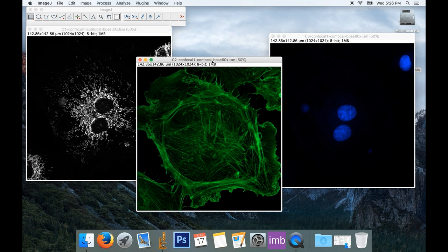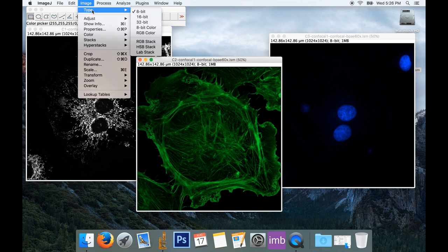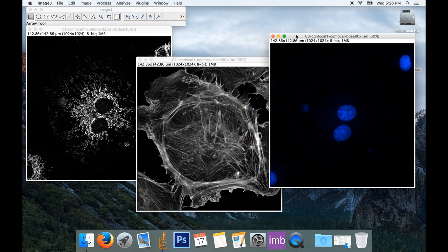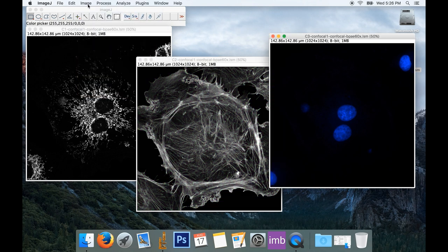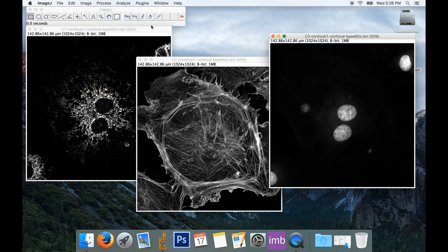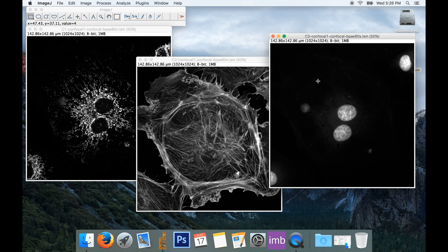So I'll do the same for my other two images. Image, Type, and reselect 8-bit to change it to black and white. And then Image, Type, and 8-bit to set it to a grayscale image again.